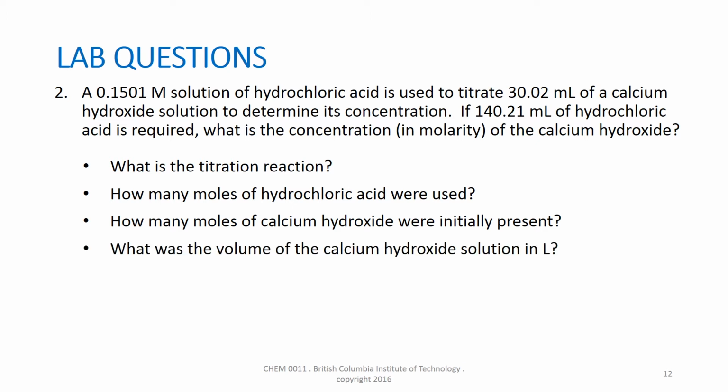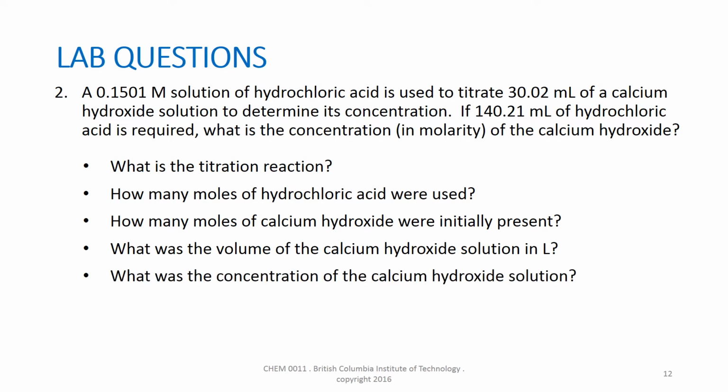Convert the volume of the calcium hydroxide solution into liters. Dividing the moles of calcium hydroxide by the volume of the calcium hydroxide solution will give the concentration of the calcium hydroxide solution. Remember to watch your significant figures.